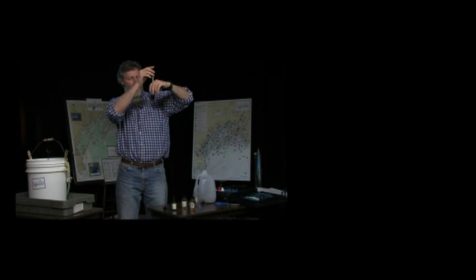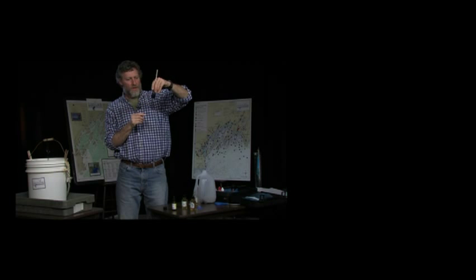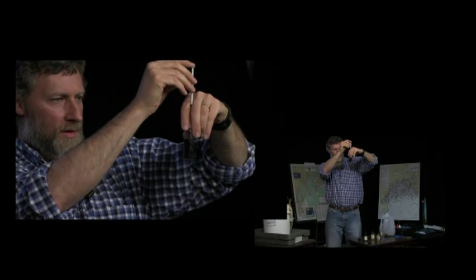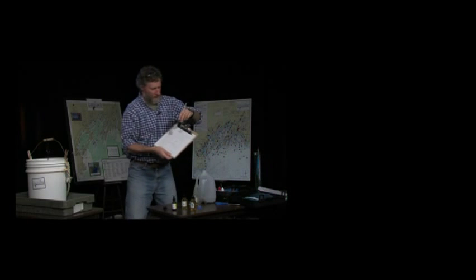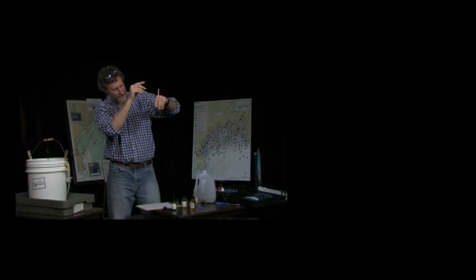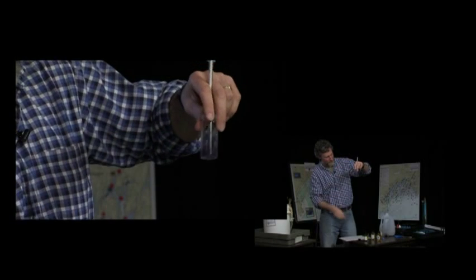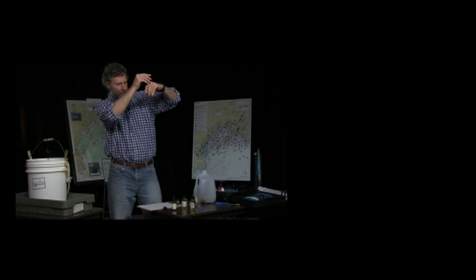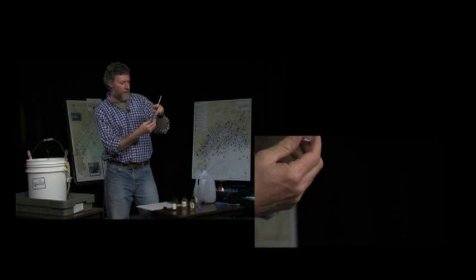Now what I'm going to do is continue to add more of this thiosulfate to the sample, and eventually we're going to get very close to clear, and then all of a sudden I'll add one drop and it will go clear. And we're getting close. Sometimes you can use your data sheet to verify, is it clear yet? No, not quite. Getting close. Still has a little bit of a color to it. Poof. Looks like that one drop did it. So that's the end of the titration part.